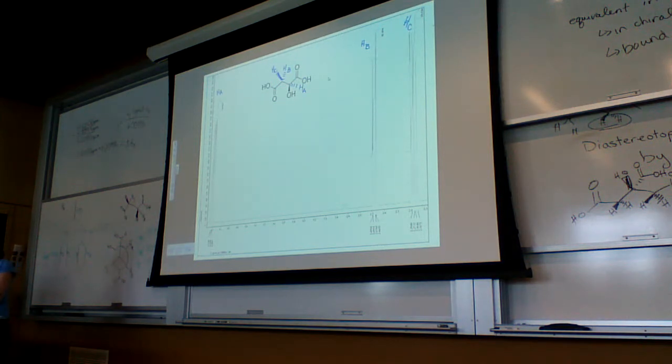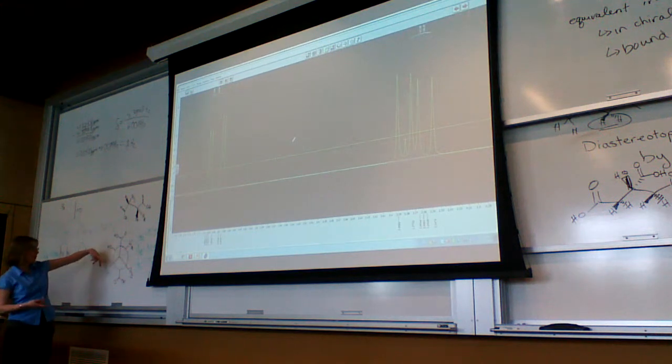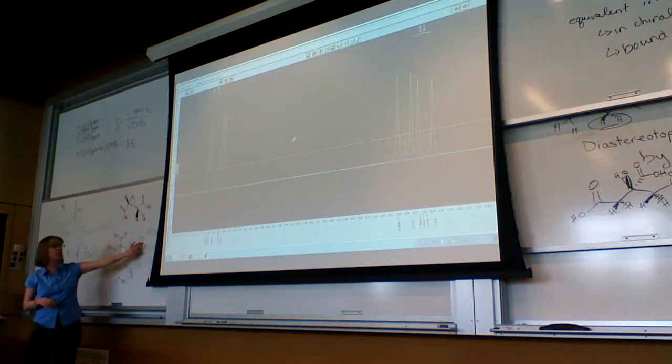So we're going to do some more examples, Sheldon. So, would you not find a J value of 15.5 in the H of A at all? No. Because there's coupling between HA and HB and HC, but it's not the 15.5 hertz that's shared. Right, the HA to HB has a different coupling constant to HA to HC. And so you don't find the 15.5. That's only between the 2 that are right next to each other.